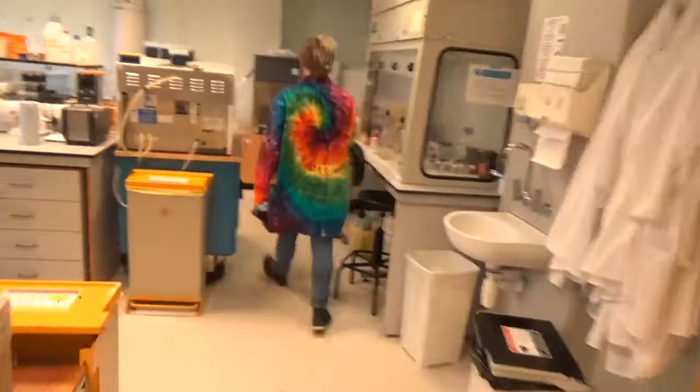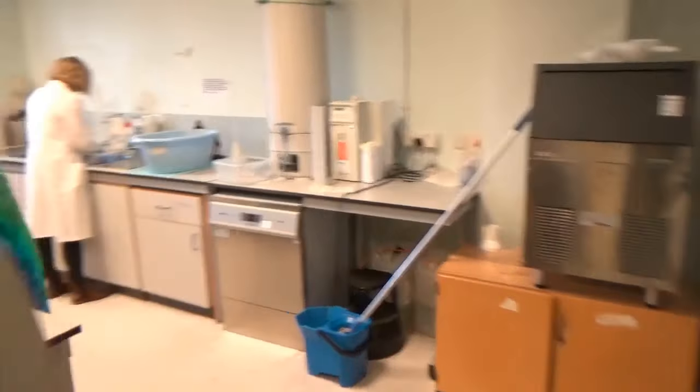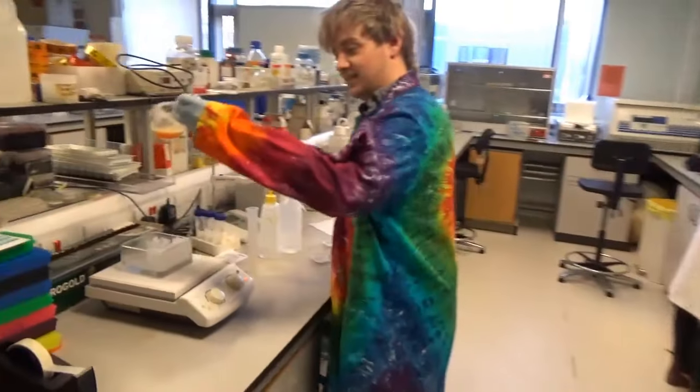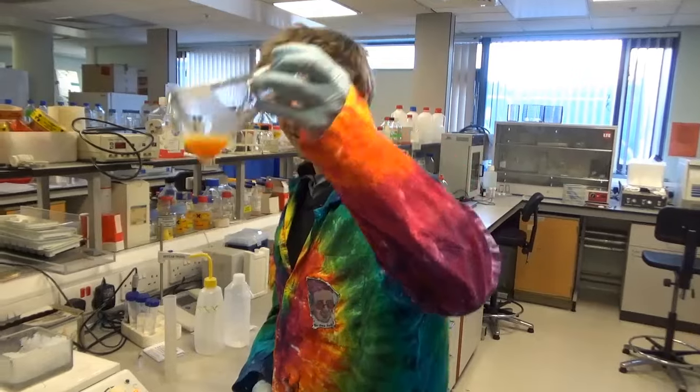And in the time that I've taken to talk about this, hopefully my little reaction will have got about over here, and it'll be a nice different solution, which it is, hey! So you can see, I've actually done it properly now. Chemistry, that is, on the go in the biology lab.